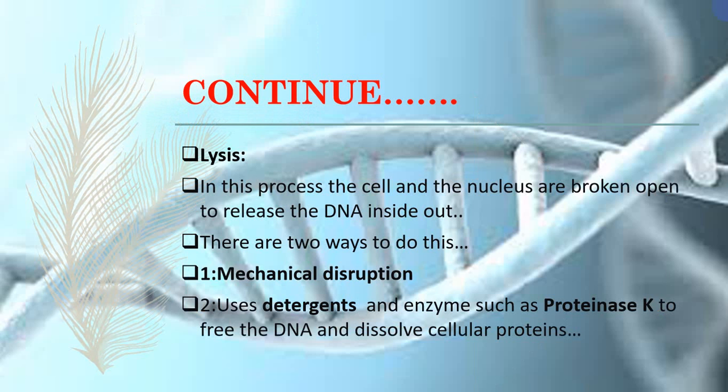Now continuing to the lysis, which is the first step. In this process, the cell and the nucleus are broken open to release the DNA inside. In the very first step, the cell, as we know, is completely covered by the cell membrane, and the nucleus is also covered by a membrane. So first we have to break down those membranes and those protections, to get the DNA out from the cell. There are two methods used for that.